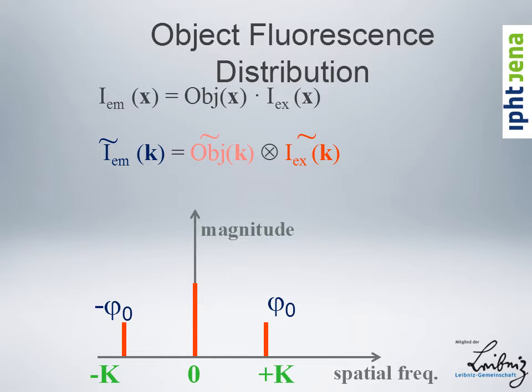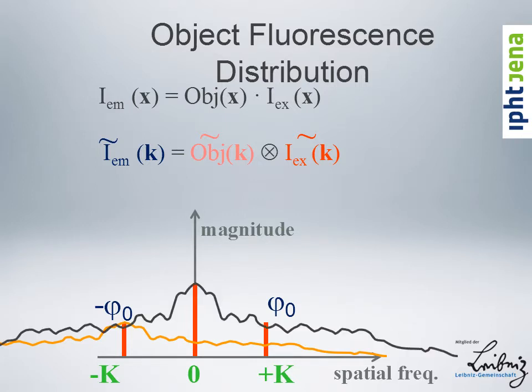But now what we are going to do is, in our head, simulate what's happening in our Moiré imaging setup. We need to convolve the object information, which is something complex, so I just represent it by some complicated function here. We have to convolve this with 3 delta peaks. Convolving, drawing with the brush, means that you have 3 pencils. So we have to basically add up the signal from the same object being replicated 3 times in Fourier space.